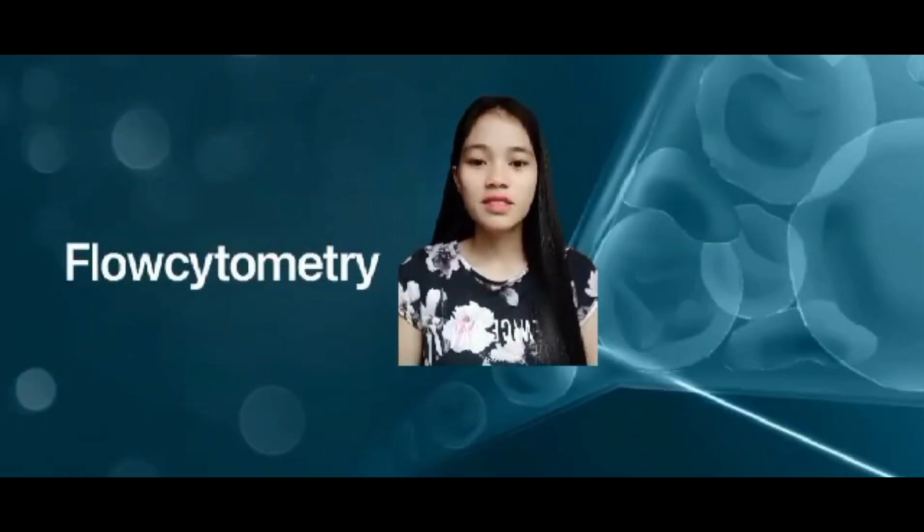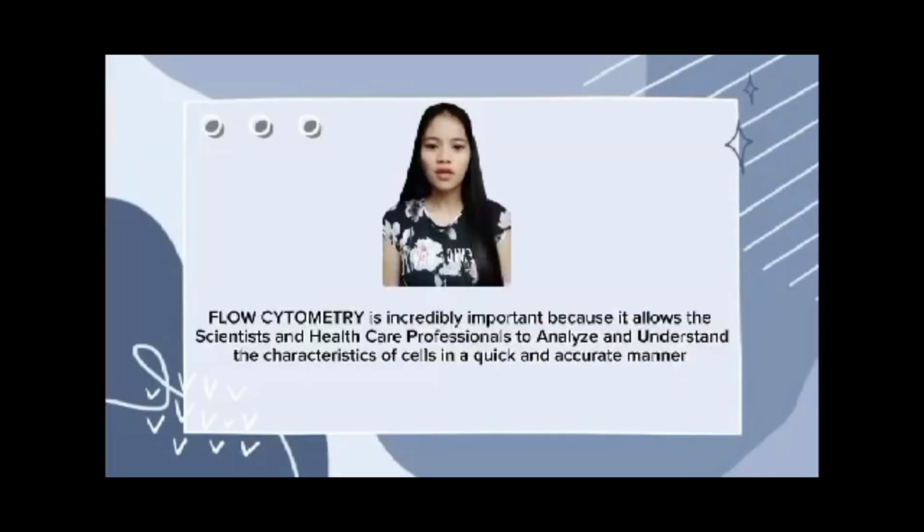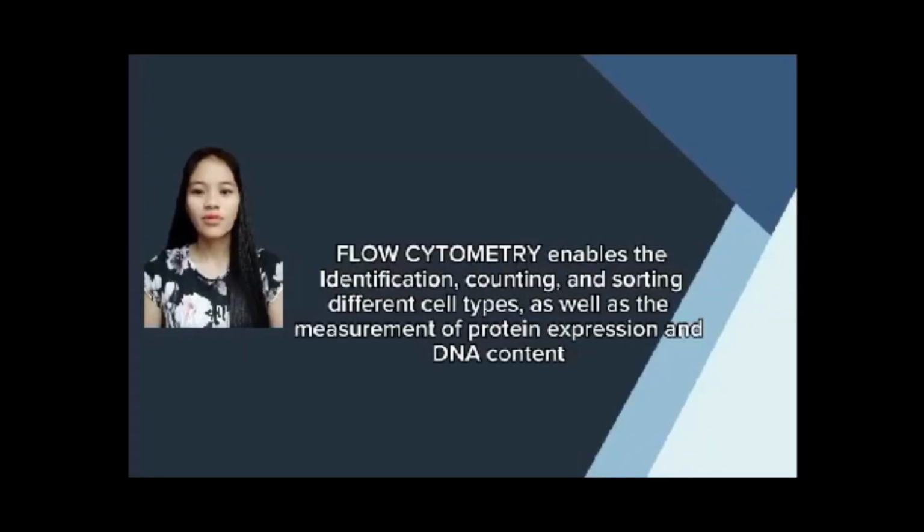And now, let's proceed to the importance of flow cytometry. Flow cytometry is incredibly important because it allows scientists and healthcare professionals to analyze and understand the characteristics of cells in a quick and accurate manner. It enables the identification, counting, and sorting of different cell types as well as the measurement of protein expression and DNA content.